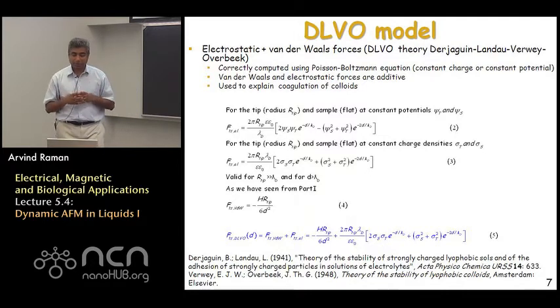Nonetheless, it's important to understand the validity of these equations shown here. They're valid for whenever the tip radius is much larger than the Debye length, and they're also valid for when the separation is more than the Debye length itself.